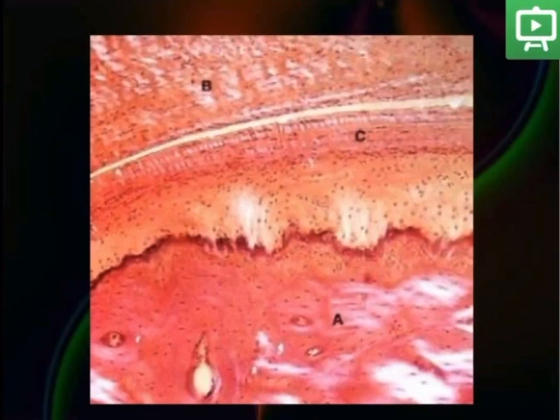The circumferential collagen fibers, mostly at the peripheries of the disc, are crimped or in wavy appearance, or compressed into folds and ridges, as could be seen. This is mostly in the peripheral discal area, as we said, mostly to adapt for the tensional loads being generated at this site.